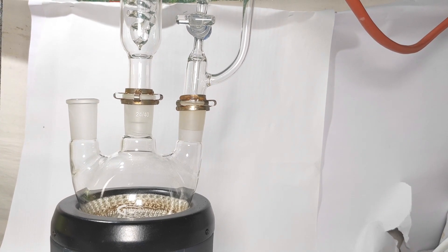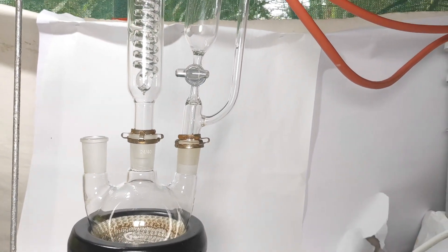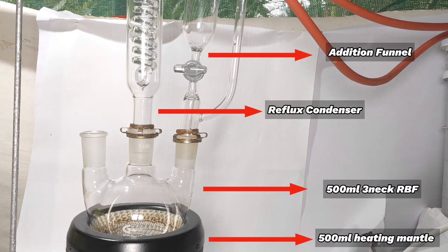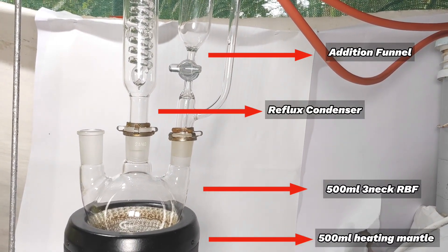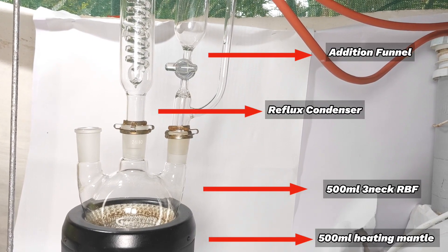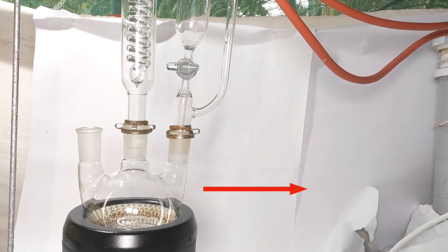A 500 ml three-neck round bottom flask is placed in a heating mantle stirrer. A reflux condenser is attached on the center neck and an addition funnel on one of the side necks. The other side neck is left free so that reagents can be charged into it.